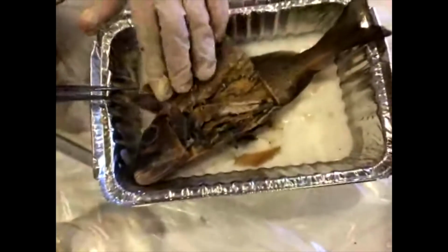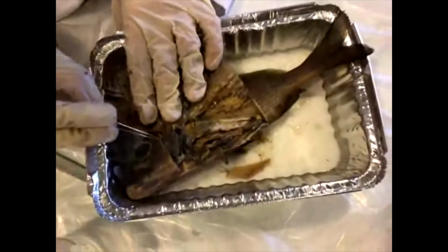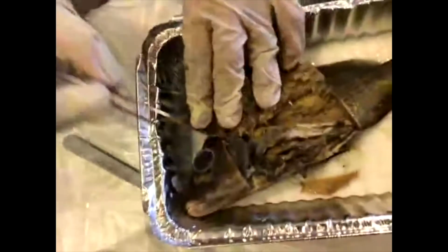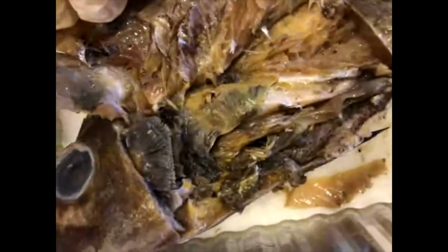Now, there's one other structure that I want to show you that's really cool before we make any more cuts. And that's the gills. The gills are this gray structure here. If you get really close, you might be able to see that there are different separations in them. Are you able to see that? Yeah. And then there are also different layers. I could take all of them out. I'm not going to take them all out, but there are actually 4 layers like this on each side of the fish. And you can see all these feathery projections.